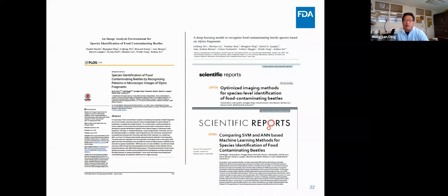If you input a good image, a good result will come out. So we think that's how to take a high resolution, good image for the system. We developed an SOP for that, and we also compare different neural networks to see which model works better. That's all the exploratory research going on.